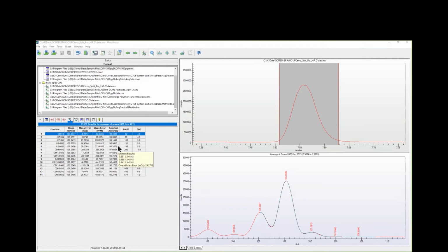The limitations here are the samples have to be relatively good signal to noise. They have to be relatively free from background interferences, although there's ways to take those into account, which I can show you, but I'm kind of going over my hour limit here. So why don't we stop here, and hopefully this was a pretty good overview so far.